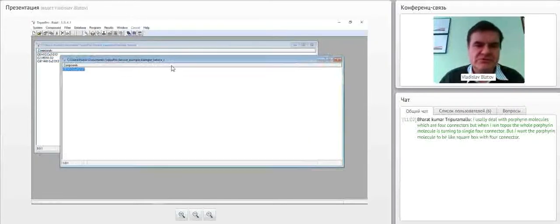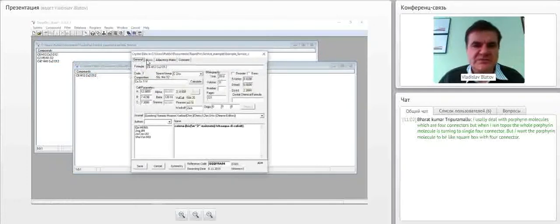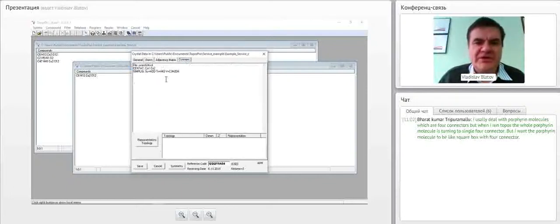Look at it. And I see that we have here some cobalt atoms and some pseudo metal atoms, scandium, titanium, and vanadium. In the comment tab, we can see that scandium really is the center of mass of water molecule. Titanium also water molecule, but disordered, because here we see some extra hydrogens. And the vanadium is the organic ligand.